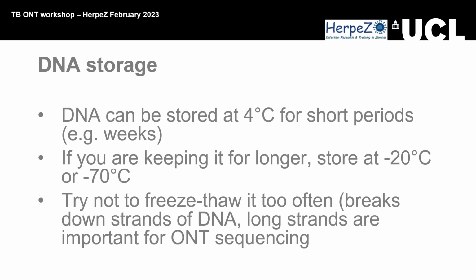Sequencing is, as I say, you need a lot of DNA, you also need good quality DNA. If you're doing PCR, you don't need that much, and so it doesn't really matter if you kind of smash it about. So yeah, as Caren was saying, you have to be very gentle with it. Don't pipette it violently up and down because you're going to shear all that DNA. You have to treat it like a baby and make sure it's very happy and very long.